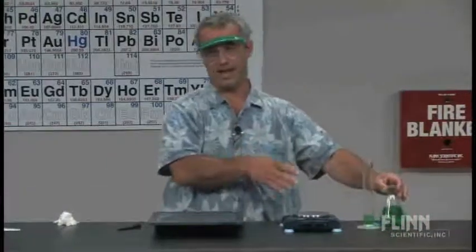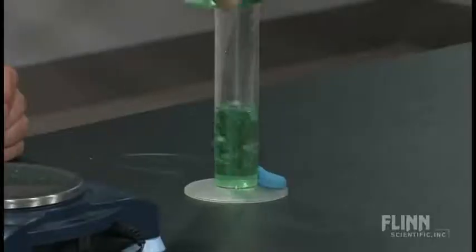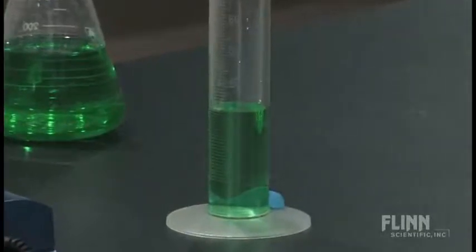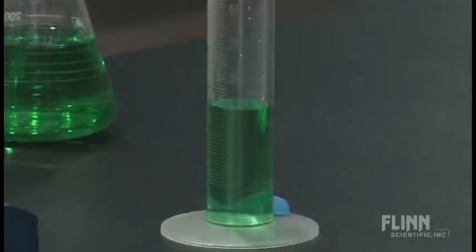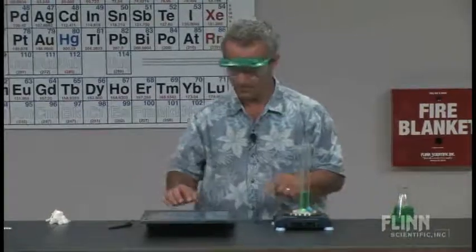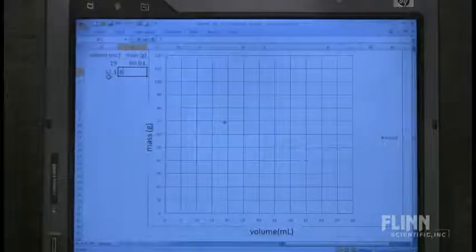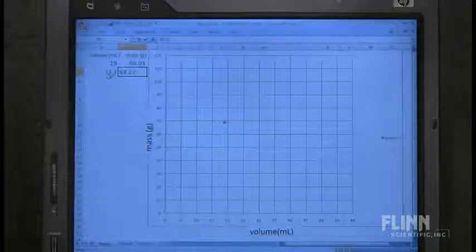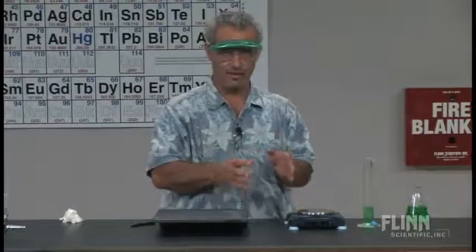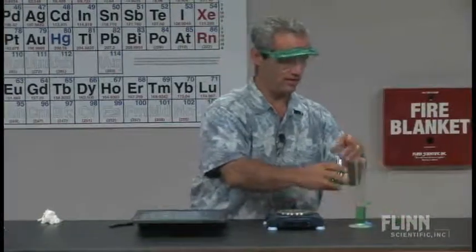They take that back and add some more — another 15 to 20 milliliters. I'm reading the volume as 32.1. So we have a volume of 32.1 and a mass of 84.22 grams — I'll enter those in the table. The scale varies a little on that last digit, which is common. A lot of students think that if it's digital, it's automatically exact, but of course it's not. The last digit on a scale is just as imprecise as the last digit read off a graduated cylinder.